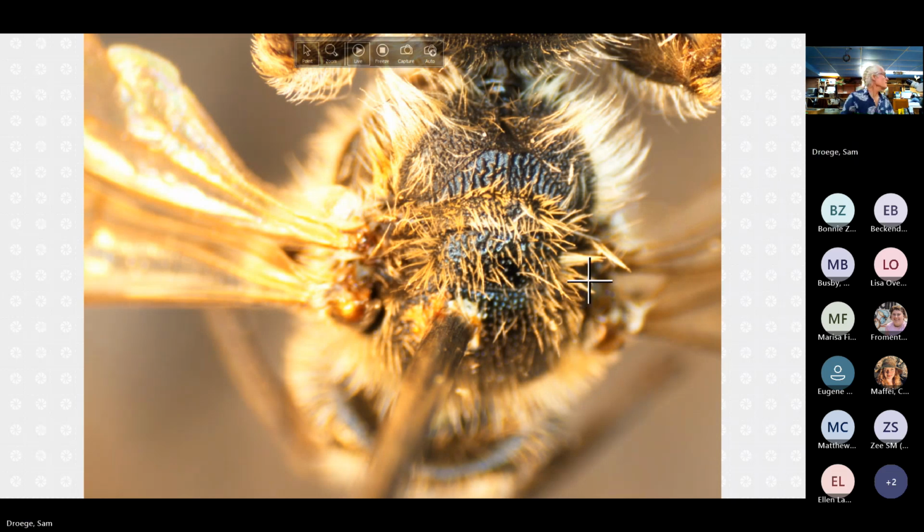And so what we're looking at here is a propodeal triangle. Recall that the tip of the triangle usually, I'd say always, bends over to the vertical face of T1. The difference here is that there is a raised line right at that bend, right there. Maybe a little bit difficult to see.